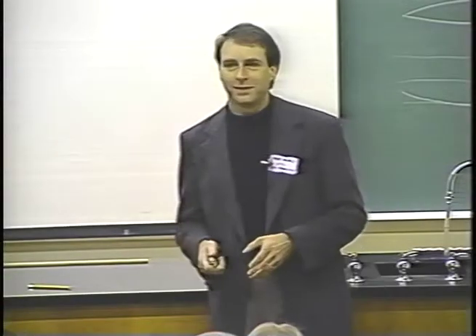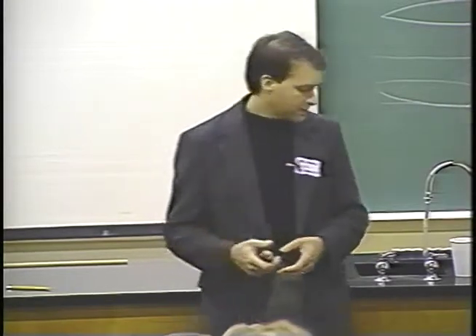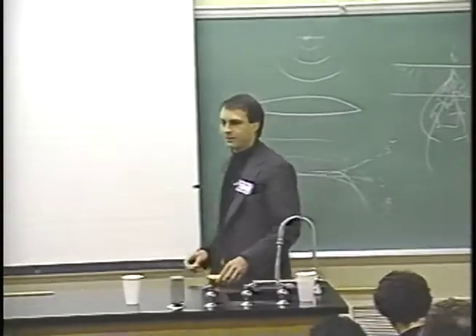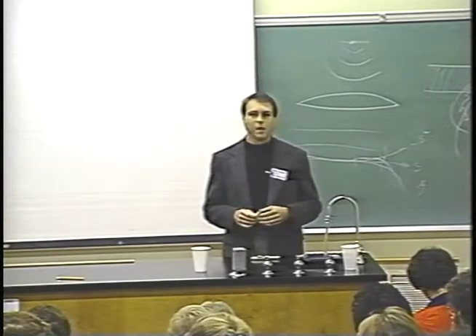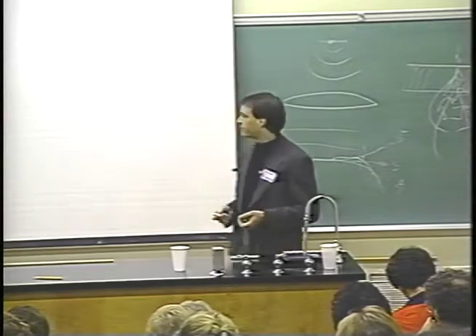What I want to do is to sort of fill in the gap between the kind of microscopy that we just heard about from Ken and what Lee Peachy talked about. That is, what Ken was discussing was a type of microscopy ideally suited for ultra-high resolution, essentially atomic structure resolution of what amounts to monomolecular crystalline films.